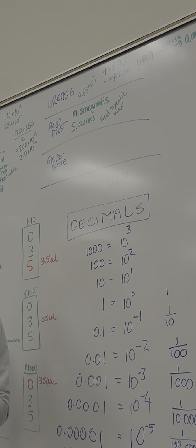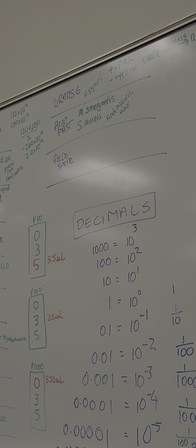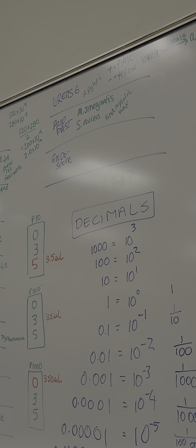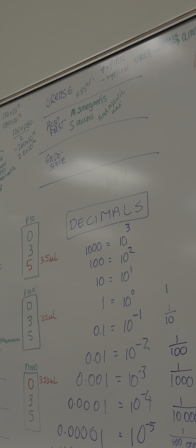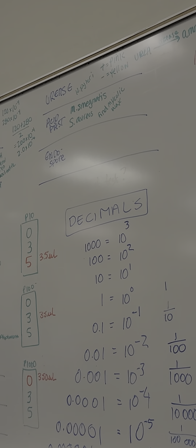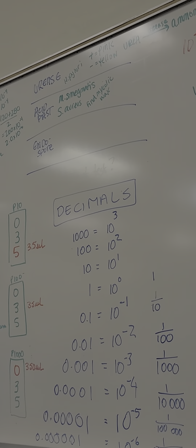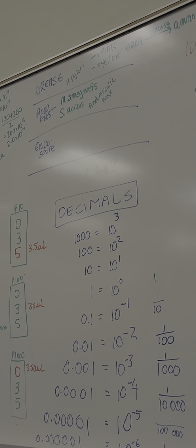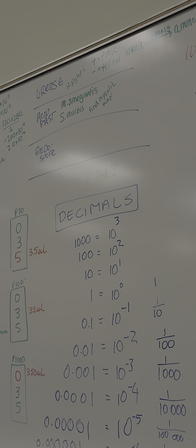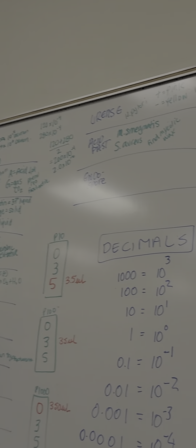So mycolic wax, so if you say mycobacterium, it has this mycolic waxy acid material on the outside. So what other organism other than Mycobacterium smegmatis, which one are we really worried about? Tuberculosis. So that's Mycobacterium tuberculosis. Tuberculosis, 2 billion people on the planet have tuberculosis.